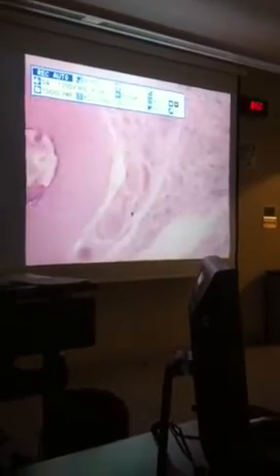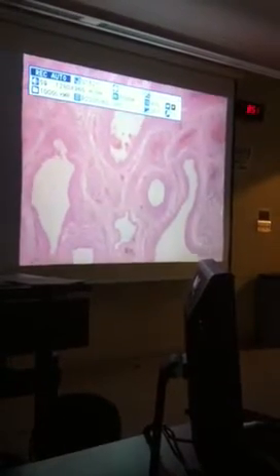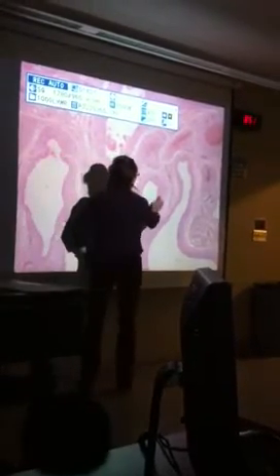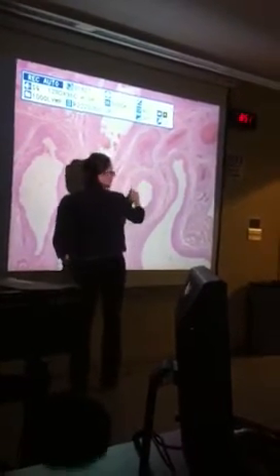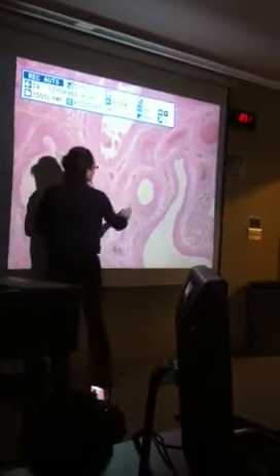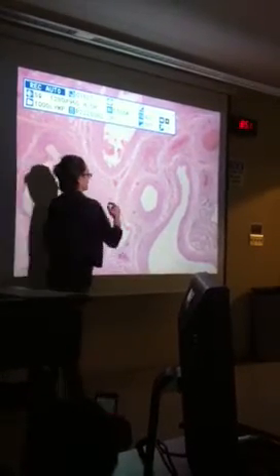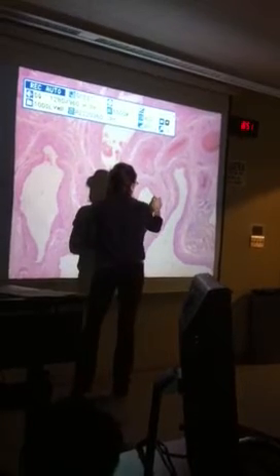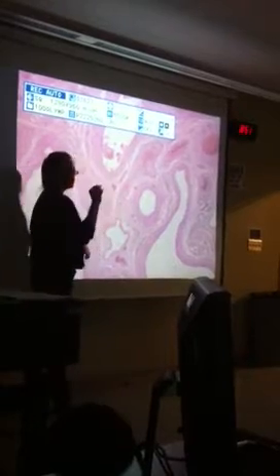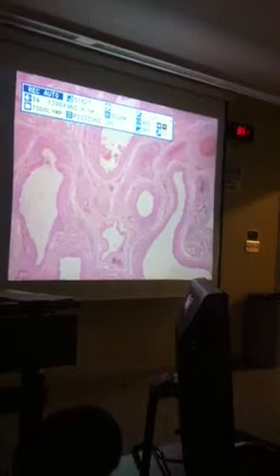If we move over and then look at arteries versus veins, this is a good section here. This right here would be an artery. So again, you can see it's very round, but it's not nearly as big as what we just looked at. Here, you've got a layer of smooth muscle, but not nearly as big as what we just looked at. You've got epithelial cells lining the lumen, and these, you can see, are much shorter than the ones we just looked at. So those would be simple squamous epithelial cells.